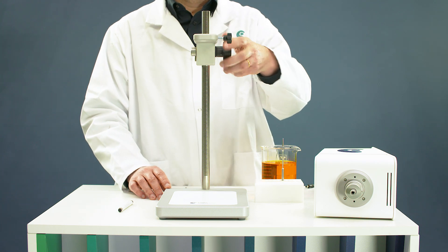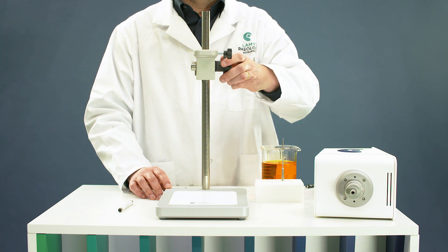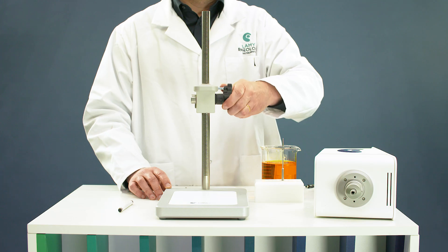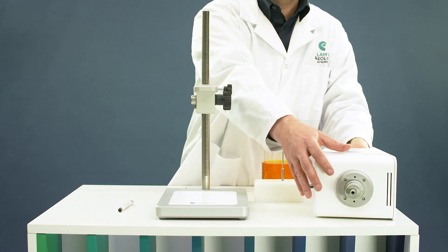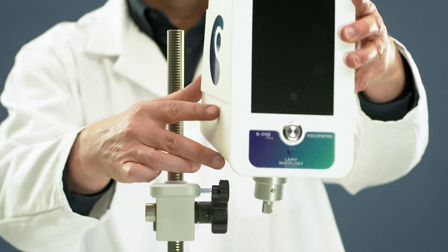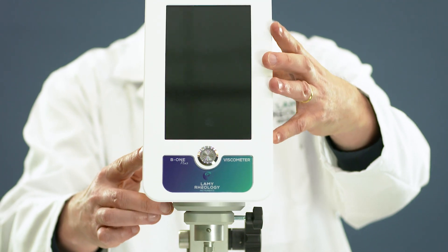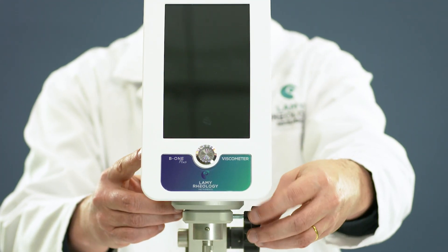Move down the rack stand. Take the measuring head and install it on the arm, then lock the measuring head with the screw.